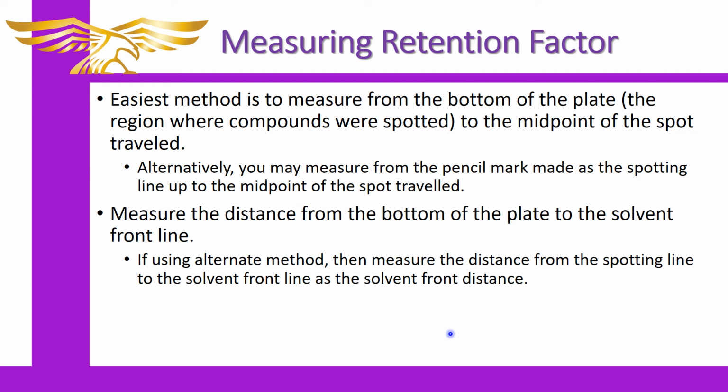When we talk about other chromatography methods, instead of a retention factor, we often use what's called the retention time. But we won't get into calculating that until later on down the road when we talk about gas chromatography. And even then, it will be more of an observation than a calculation.